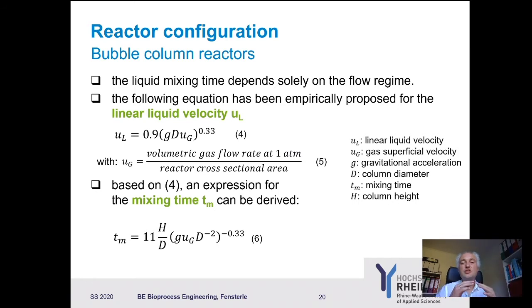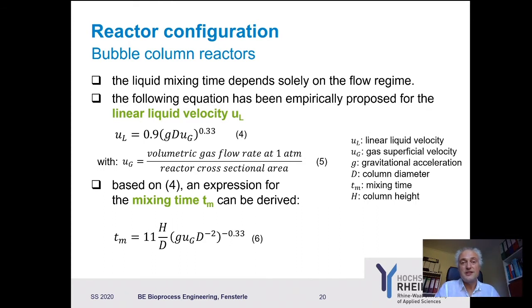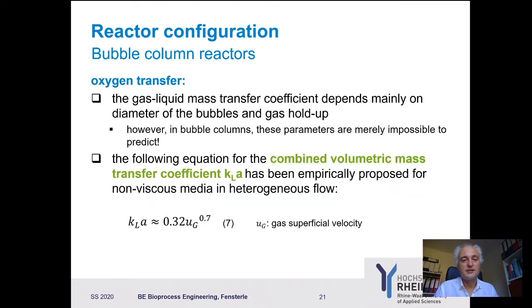So I need to adjust my controller so that it waits until the mixing time is achieved, or it doesn't pump in too much. The mixing time then dictates my settings for the sensors, in order to control the stream. So that's the importance. If you already have your things going on in your reactor, this is not an issue. However, your pH and antifoam and so on, this is what you're ultimately interested in.